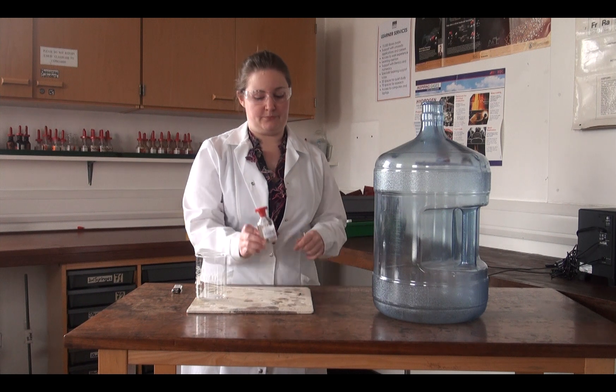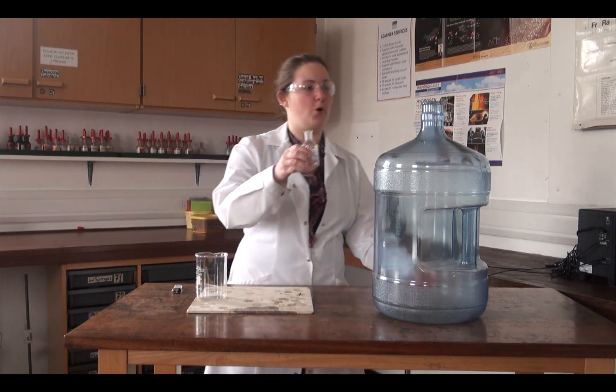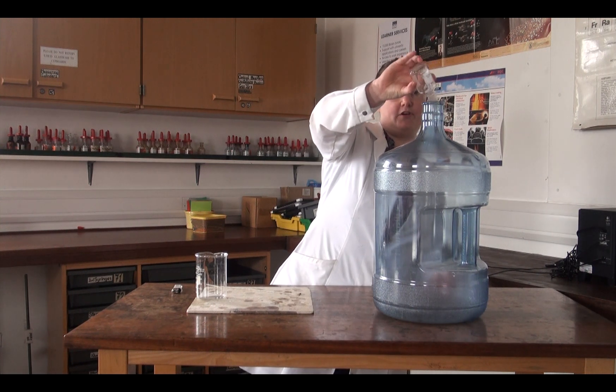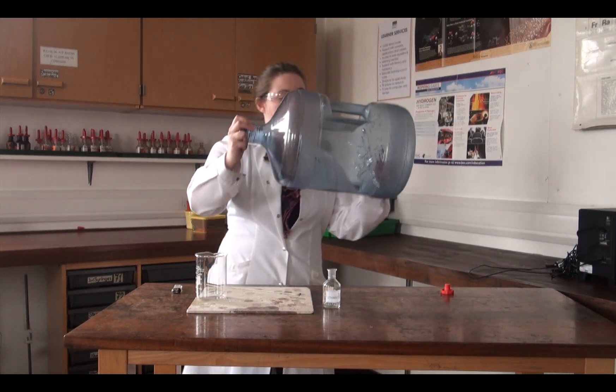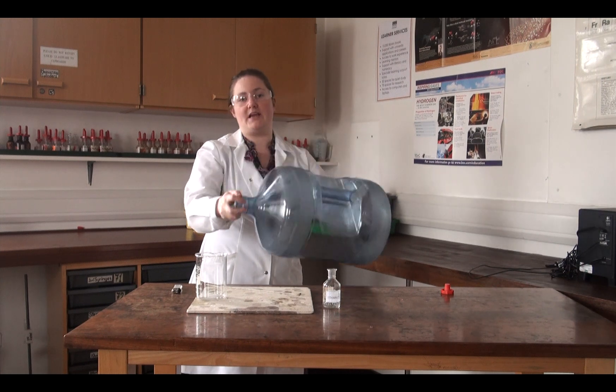The demonstration we're going to do today is to show the combustion of ethanol, a highly flammable liquid. We're going to pour all our ethanol into this large bottle here, and then we're going to shake the bottle around. What we're doing here is we're making ethanol vapor.